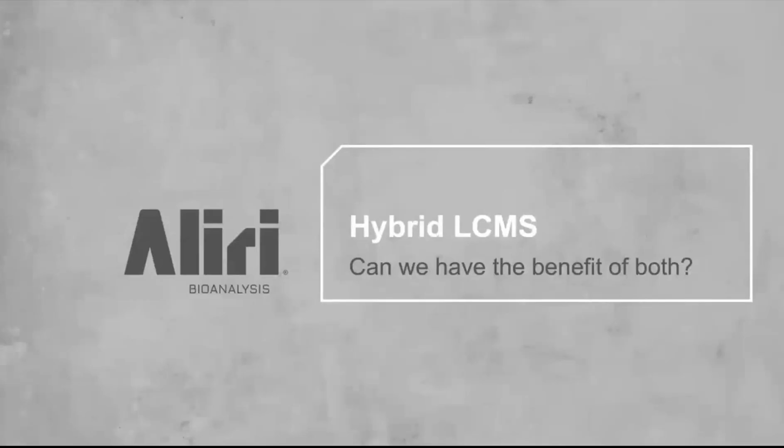So one advantage of the LC-MS is that it is highly specific. However, in a direct digest, you still have a large amount of biological material available that can lead to complications or interferences that prevents you from gaining the specificity required or the LOQ that you desire. So why don't we incorporate capturing the protein of interest?